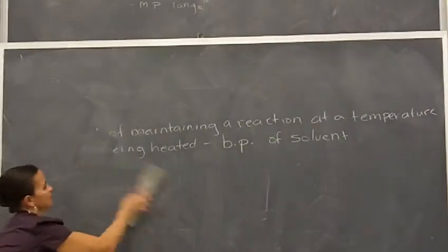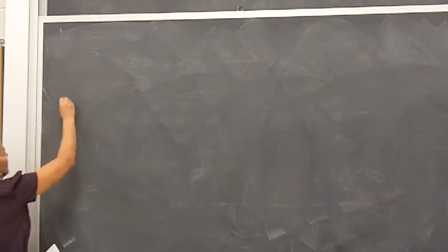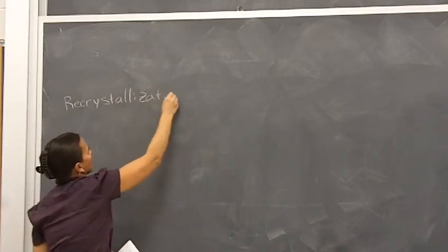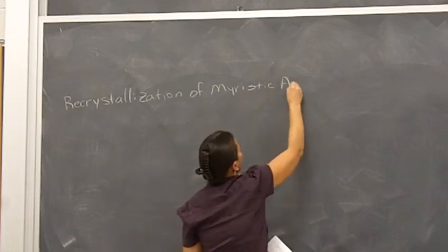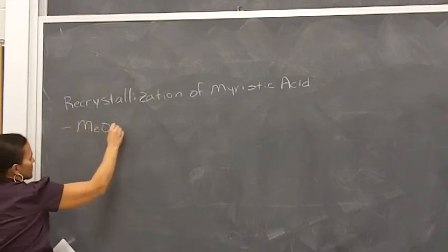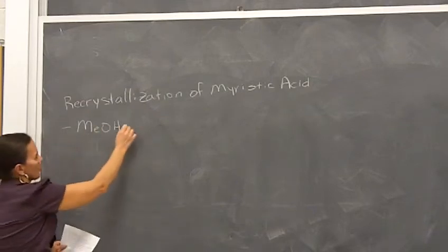So after you isolate your myristic acid, then we need to purify it, all right? And so just like in experiment 1, what did we use to purify our solids? Crystallization. So we're going to do the same thing here. And we're going to use methanol for our recrystallization, okay? We start with methanol, and then after you've got everything dissolved in methanol, you're going to use a little bit of water as a co-solvent as well, okay? But what we're heating is our methanol, all right?